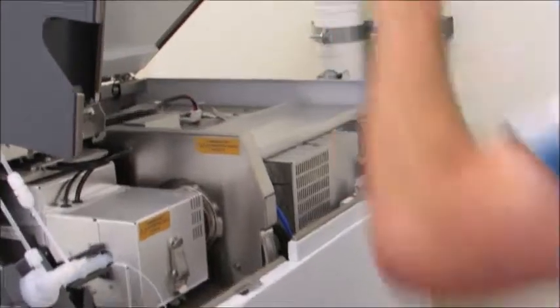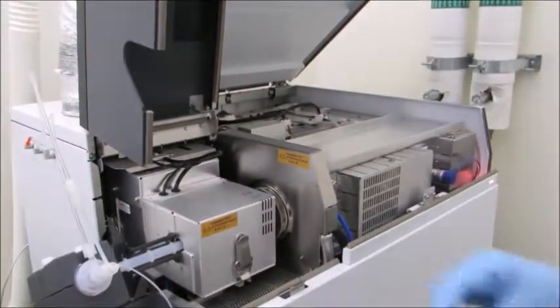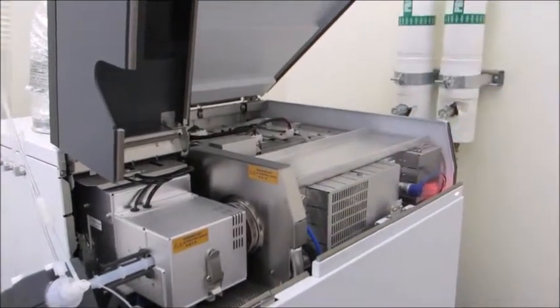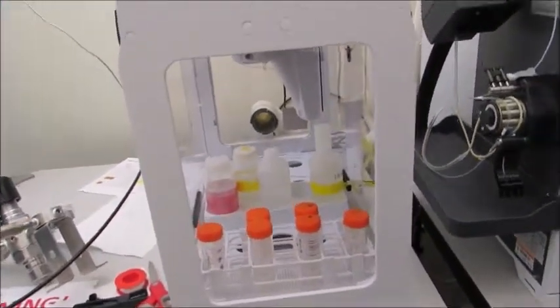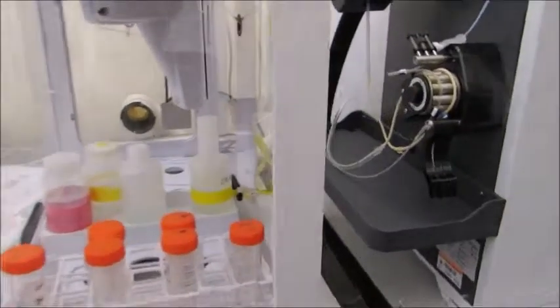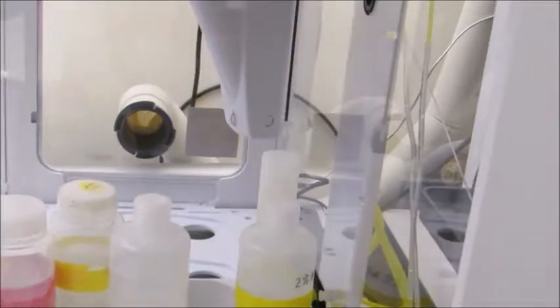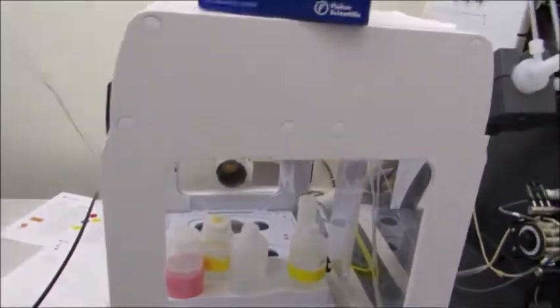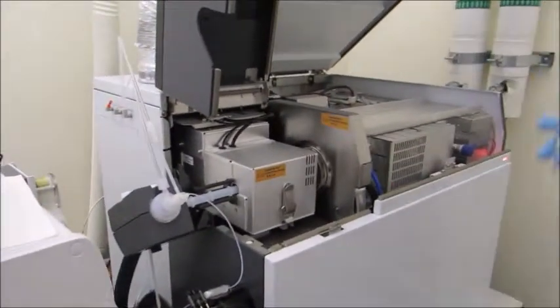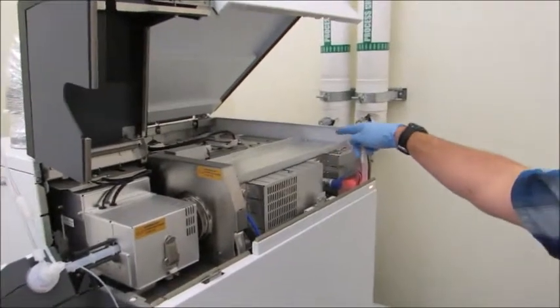You can put a laser on in front of them and blast samples and measure in situ uranium lead dates. But what we do is we load these samples into this sample chamber over here. And if you can see in the back middle, there's a little Teflon straw. What that does is it sucks up about 500 microliters of this sample and puts it into the machine for analysis. So what an ICPMS does is it actually has a very similar mass spectrometer to what we saw in the helium machine, which is a quadrupole mass spectrometer. That is in this chamber over here.